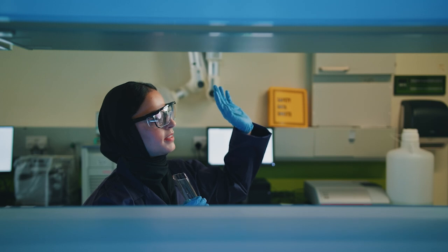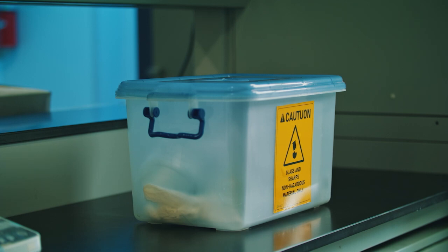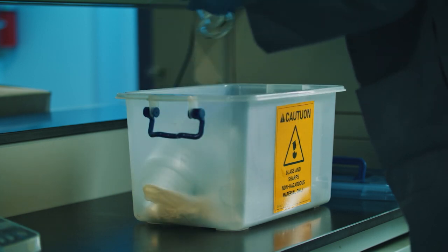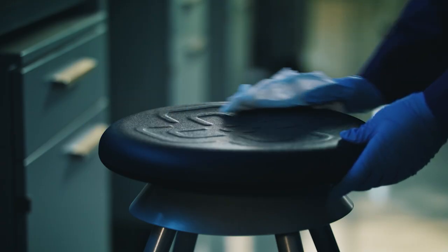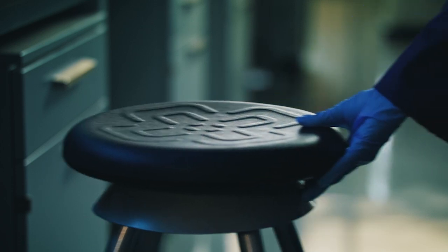Inform your instructor immediately if the glass is broken or chemicals are spilled. Broken glassware should always be disposed of in a broken glass disposal container and never in an ordinary trash can. Wipe your bench area before leaving the laboratory to ensure others will not inadvertently touch chemical residue.